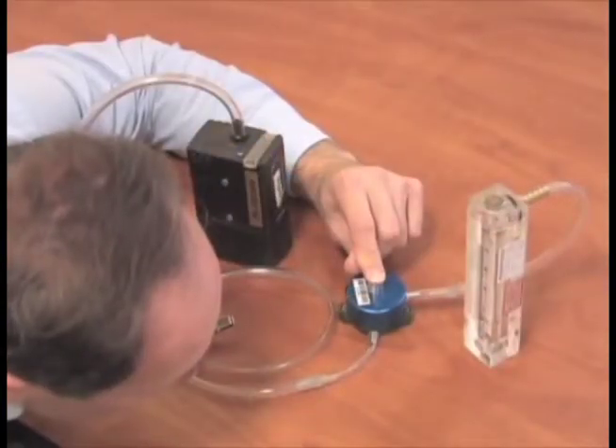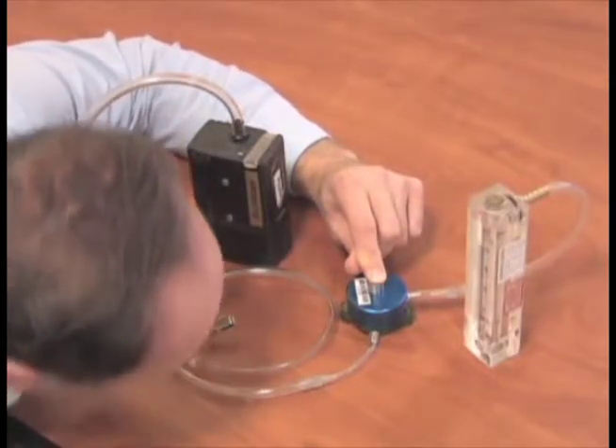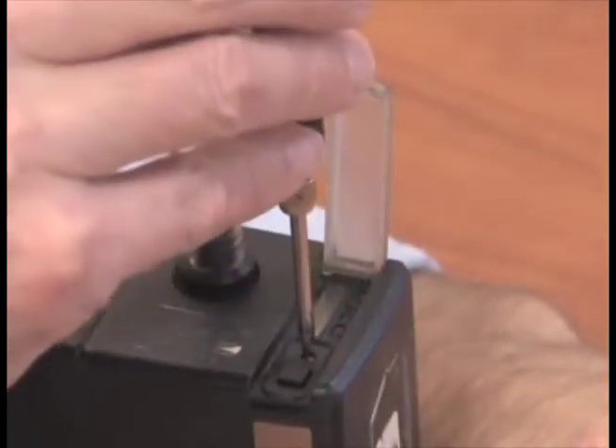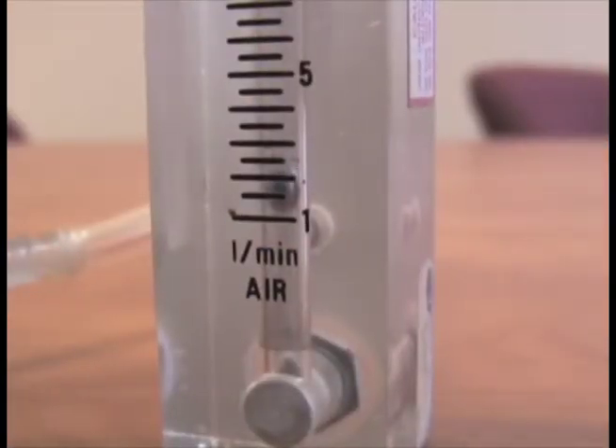With everything sitting on a level flat surface, check the ball float in the rotometer. Be sure to take your rotometer reading at eye level and use the center of the float for the value. If you need to adjust the flow, use the set screw on the pump. After you are satisfied with the flow rate, record the value on the field pump data sheet.